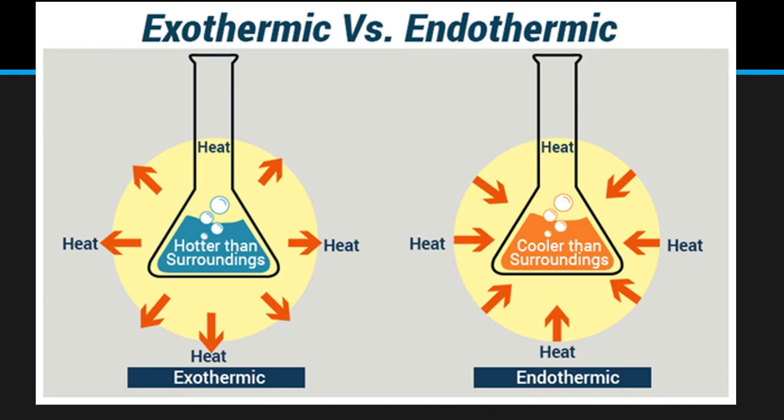All right, the next thing we would be doing is talking about our exothermic and endothermic reactions. And so you remember what those mean. If it's exothermic, that means it feels warm to the touch. It has energy that's being released. If it's endothermic, it feels cold to the touch. It's actually absorbing energy, the energy actually from your hand, the warmth from your hand.